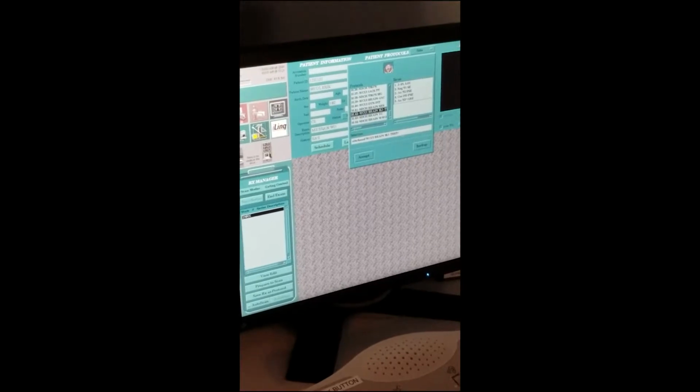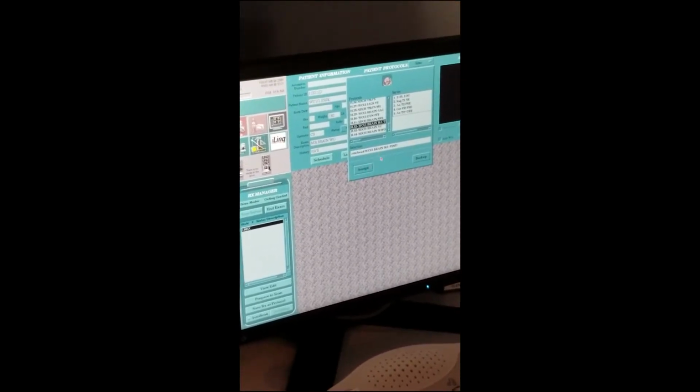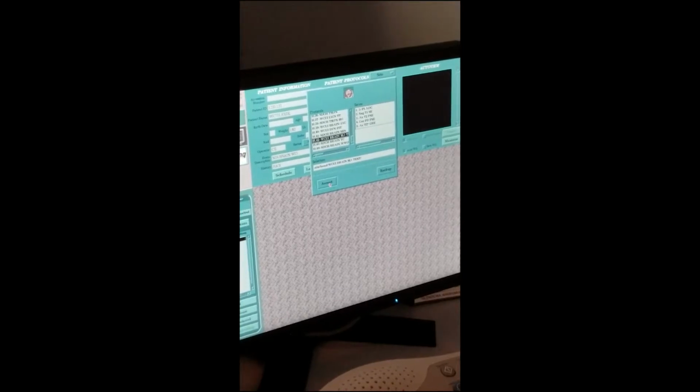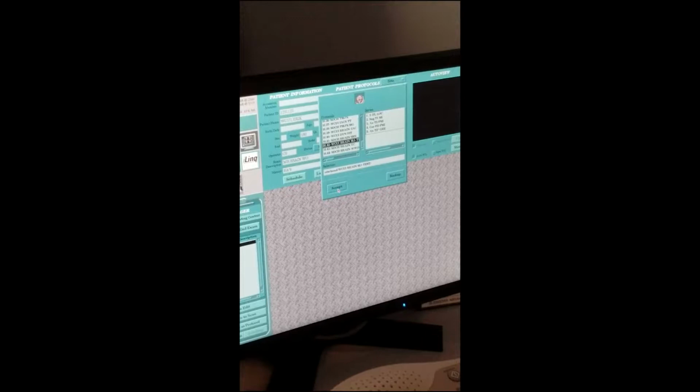Okay. Then if you want all of those 5 sequences, you bring it. You don't need to highlight them. Just say accept. Now, if you only want 1, 2, 3, 4, then you highlight them. Good. We want all of them.